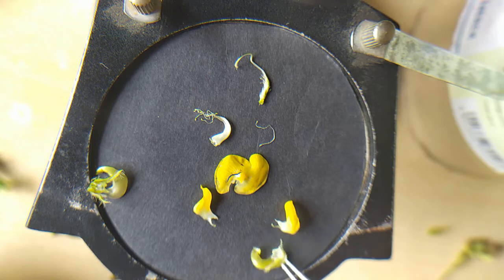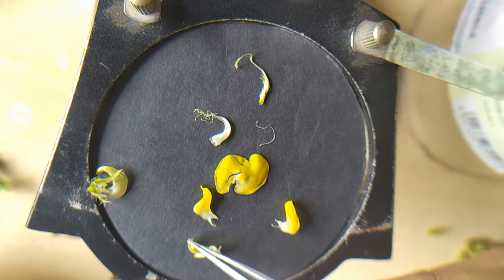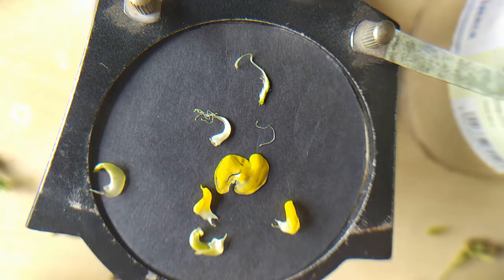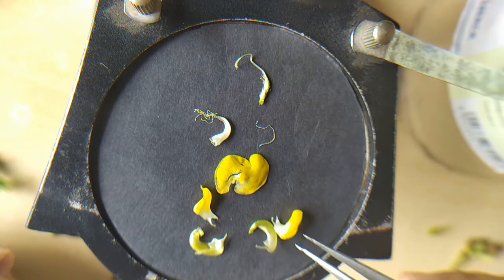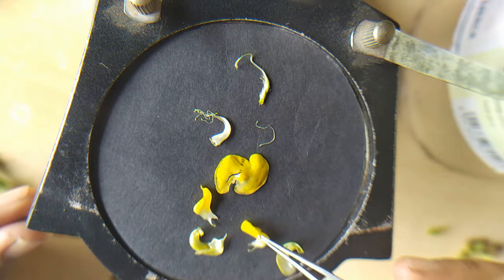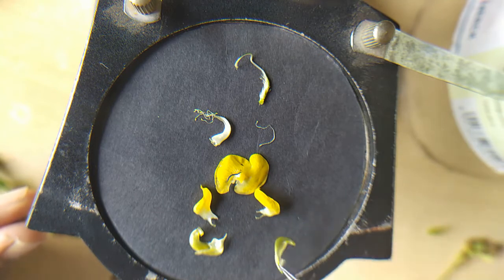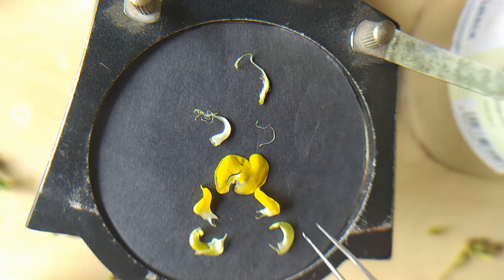The direction should be the same, with the tip on the upside and the point of attachment on the downside. Okay, now it is arranged.